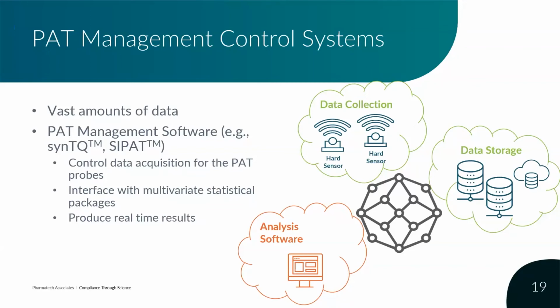Other considerations are probe type. Is it a retractable probe or not? Or is it just in situ continually? Placement, fouling of the probe, processing time. These are all big issues that you need to consider because the product flowing past the sensor window needs to be synchronized with the sampling frequency.